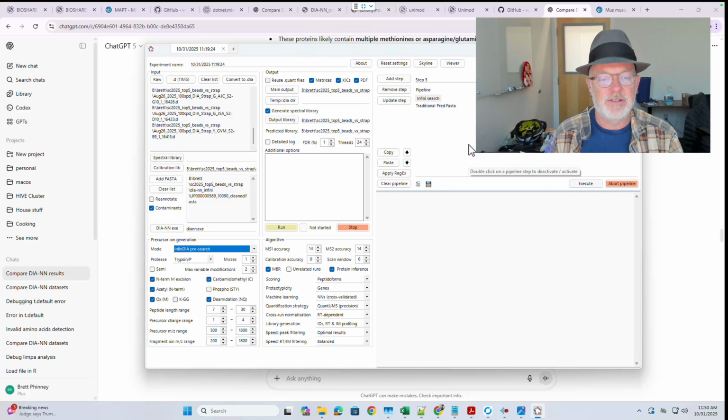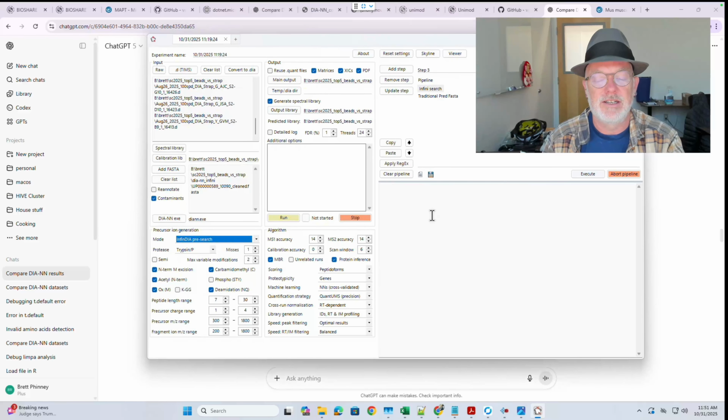I'm really happy with this version of DIA-NN. It seems really kind of neat. I like it. So anyway, if you guys have any comments or questions, just post it on the video page, and that's it. Pretty similar to the last video I did 2 years ago, and the results are pretty impressive. Okay, all right. Thanks everybody.